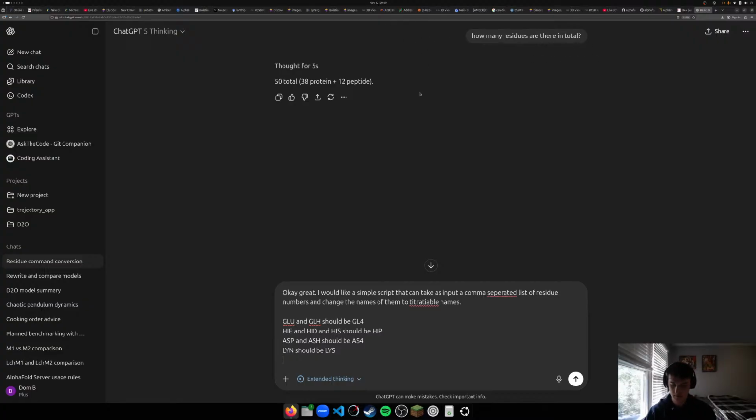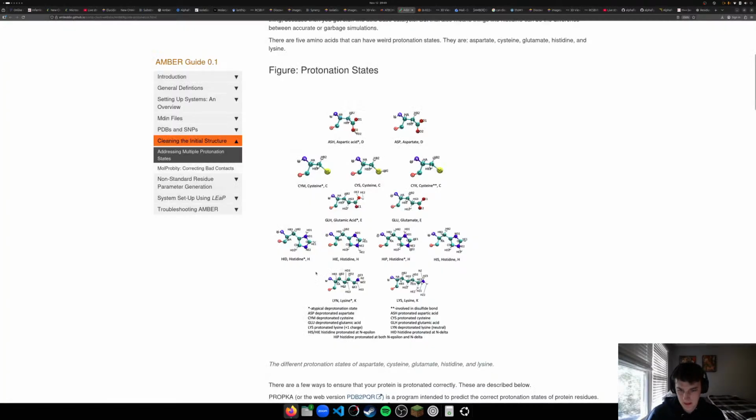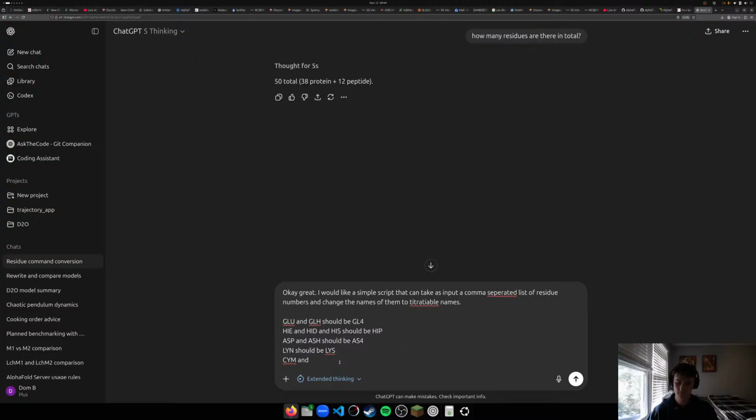And CYM. I don't think CYX is going to be anything. What even is CYX? It's for crosslinks.